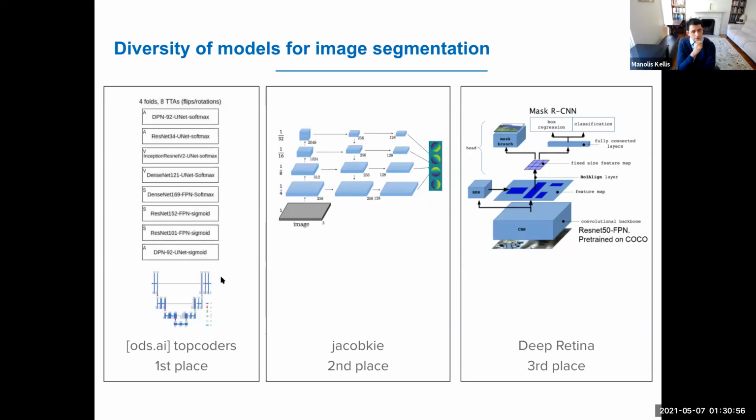Just to understand the model on the left, are the different networks talking to each other, or is every single one of them trained independently, in parallel, and then they all make a prediction in the end, and you just do some ensemble approach? That's a great question. Yes, they are independently run and independently trained. And after you do that, you take the test image and you run it through the 32 different neural networks and aggregate the output somehow in a final post-processing step.